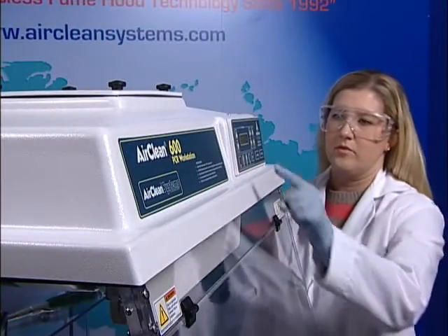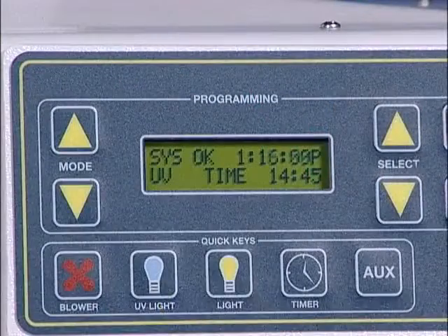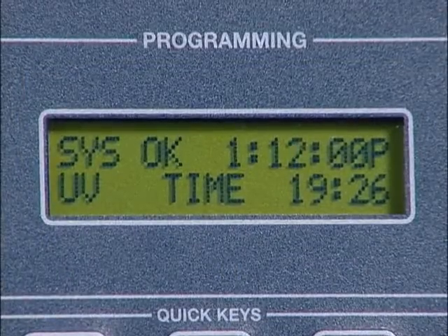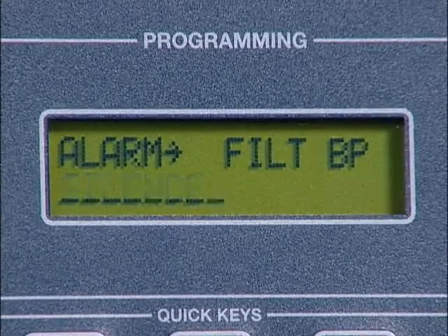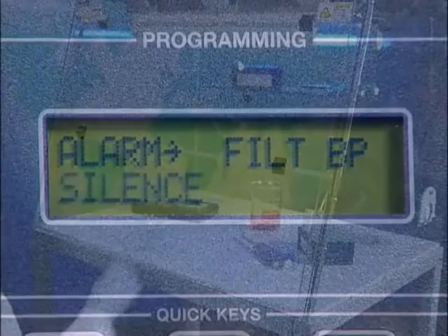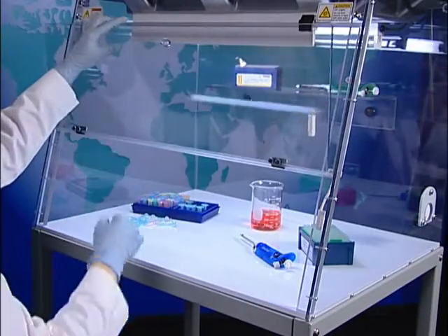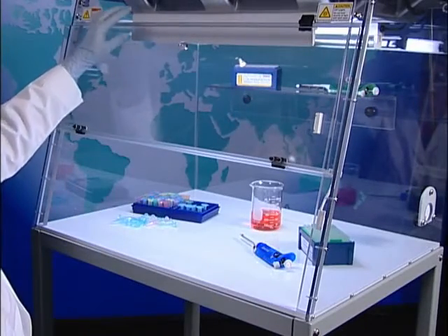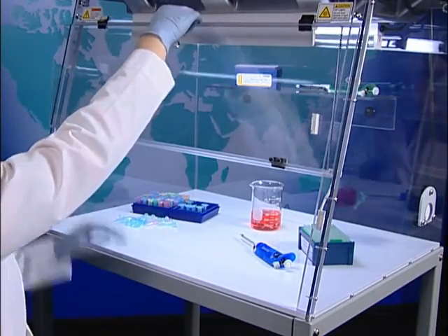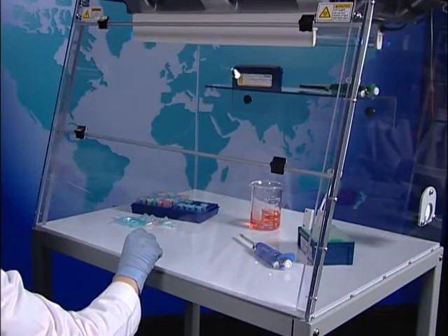The UV tech controller is standard on the 32 and 48 inch wide combination workstations. UV tech constantly monitors the effectiveness of the workstation, alerting the operator if the HEPA filter or UV bulb need replacement. UV tech automatically turns the blower on and off in relation to the position of the front sash. If the sash is open, UV tech automatically turns the fluorescent light and blower on, providing a class 100 work environment. When the operator closes the sash, UV tech automatically turns the blower and fluorescent light off and allows for the UV light to be activated.